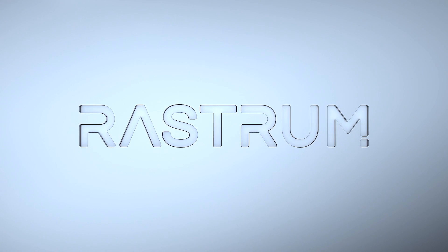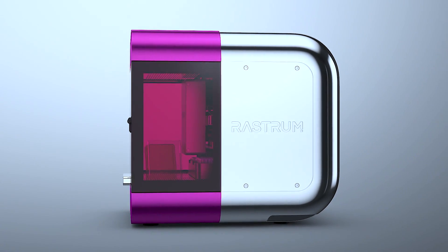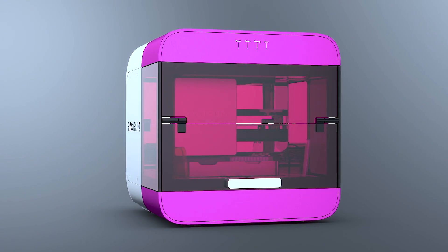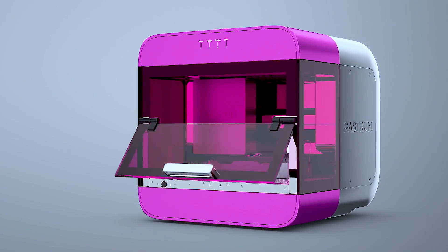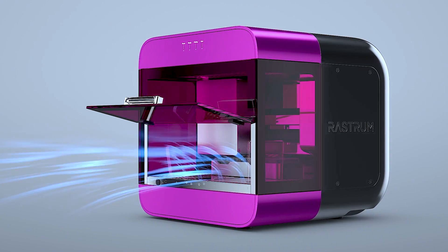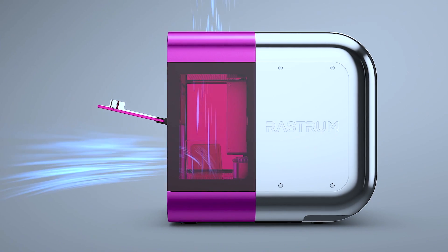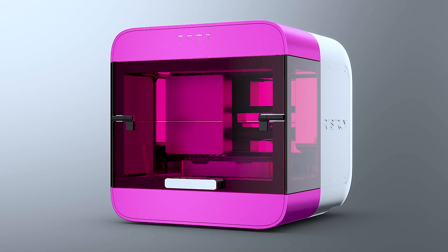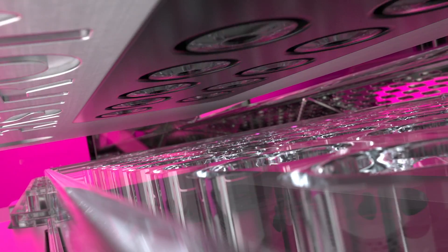Introducing Rastrum, the revolutionary 3D cell biology platform from InVenture Life Science. With an intuitive workflow, integrated laminar flow system and award-winning design, Rastrum makes complex 3D cell models simple by offering a complete end-to-end benchtop solution. Generate 3D cell models in minutes not hours with Rastrum.